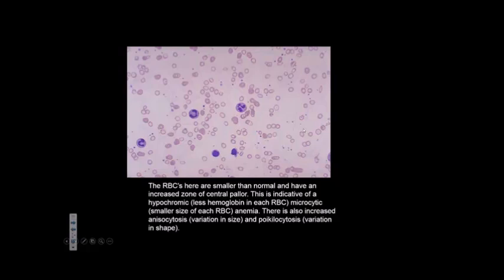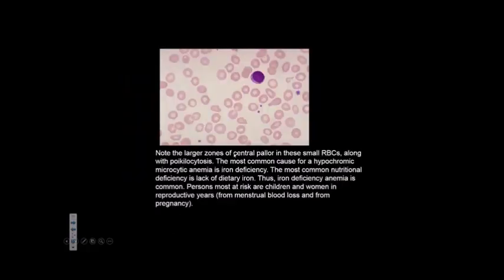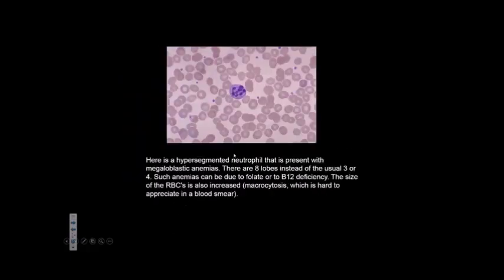And there's something else wrong with this slide too. The red blood cells, the holes in them are really big. They're really not holes, it's just where the membrane's stuck together, so this is probably iron deficient or something like that. You have 3 neutrophils, a monocyte, and maybe 2 monocytes. Another monocyte.